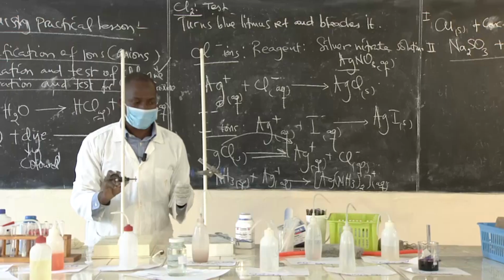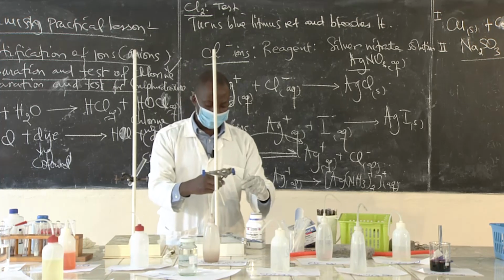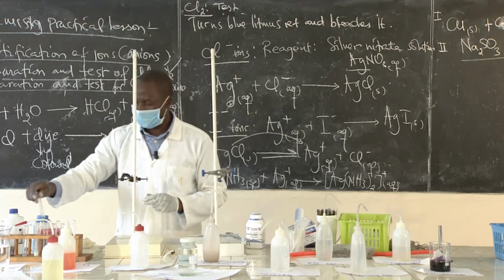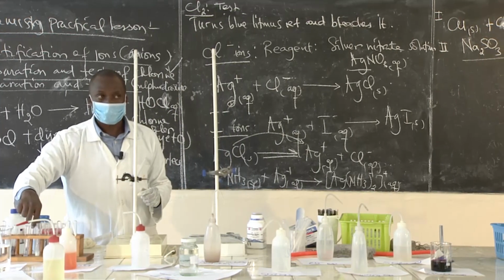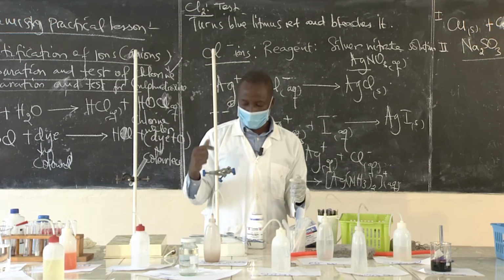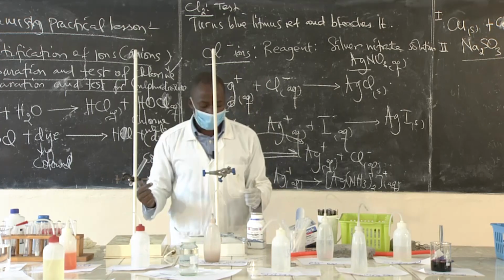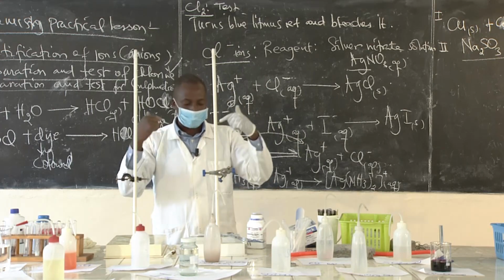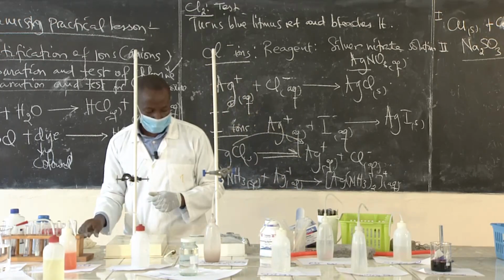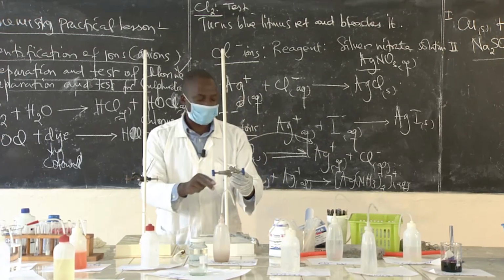So we'll need the sodium sulfite here, but we need to test the gas as well at the same time. Sulfur dioxide, I hope you remember its physical properties. It is also irritating, like chlorine, with an unpleasant smell. So choking, it attacks even the lungs. So we have to prepare it while we are protected as well.